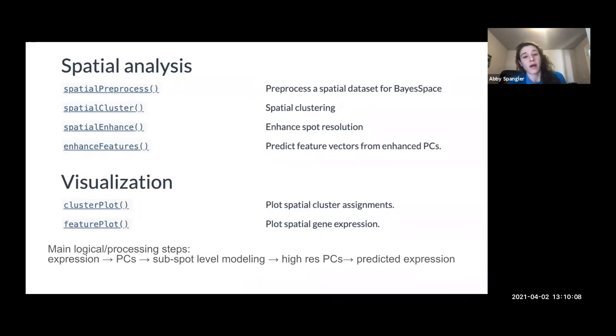So I'll walk through how you use BaySpace. They divide their functions into a couple of different categories. One is probably the most important, the spatial analysis. So the first function is spatial preprocess, which is basically preprocessing the data. It will log normalize it, find by default the top 2000 highly variable genes, and then calculate PCs or do PCA reduction on that.